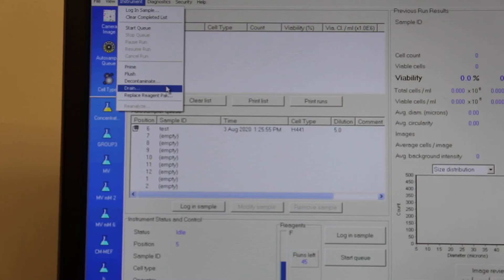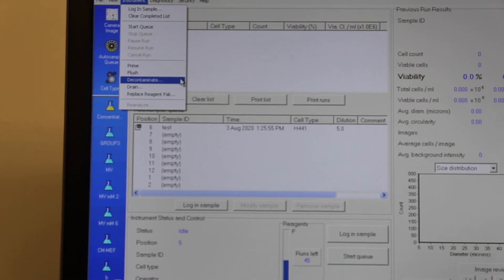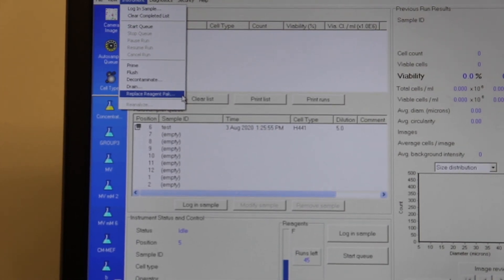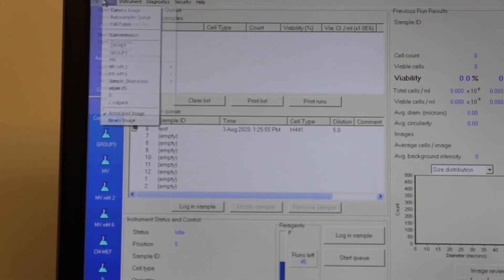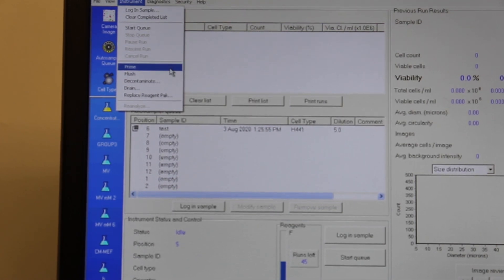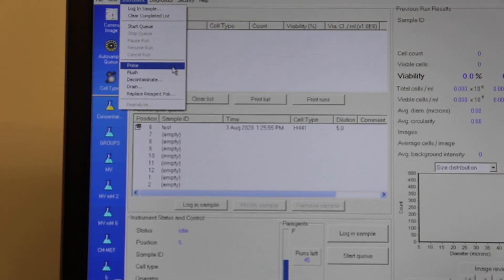If you believe the machine has been contaminated before you run your sample, you will need to disinfect it by following the steps under Instrument > Decontaminate. If this is the first time using the machine in an extended period, you will want to prime the machine to ensure it is ready for the cell sample and to eliminate any possible contamination or other circumstances that could throw off your numbers.